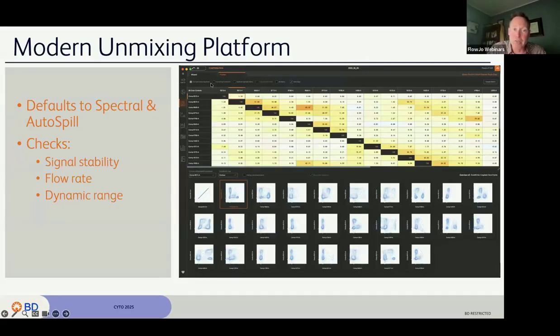You can also choose a variety of ways to view the numbers up top. So right now, this is just showing the spillover matrix. You can also switch to an SSM. You can switch to a similarity matrix. If you haven't used autospill, you can get the total spreading matrix. No one has yet invented the TSM for autospill, a job for the future. You can heat map them or not. You can hit go to create the matrix here, or create matrix to create the matrix, I should say. The button doesn't actually say go. I just think of it as the go button in my mind.